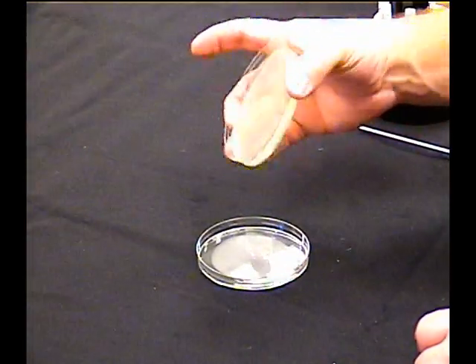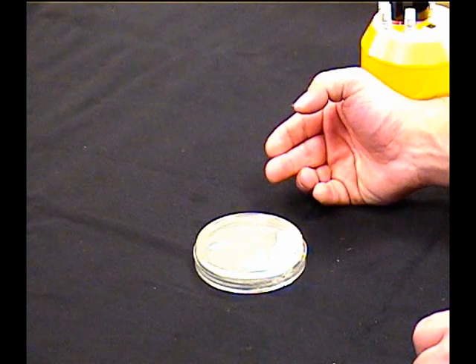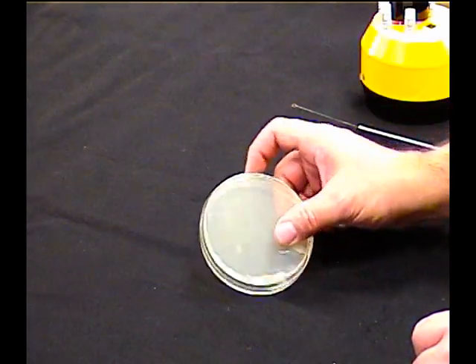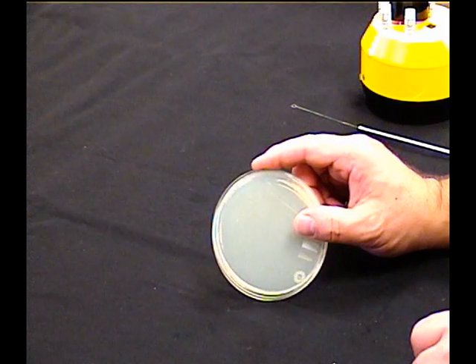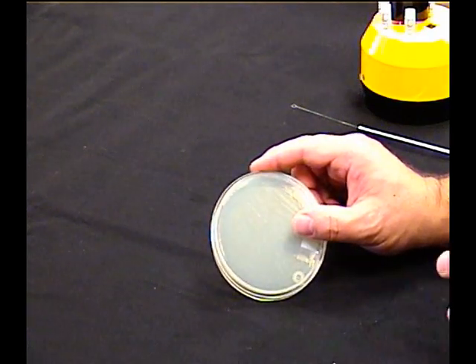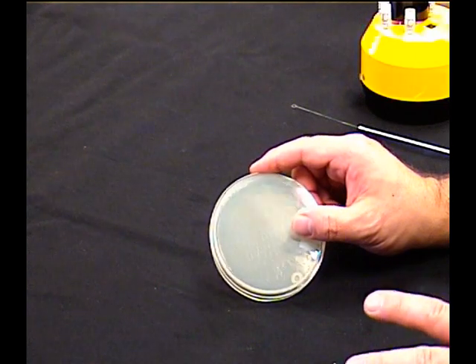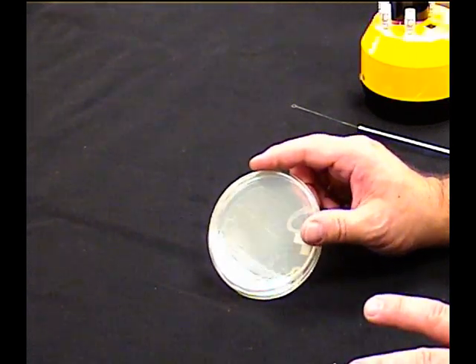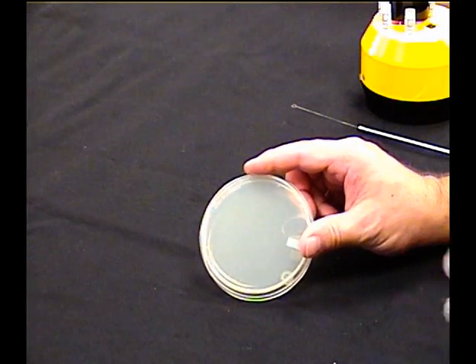Once you're done with that, put it lid down and write on the plate what the organism is and your initials. Do it now because once you get the filter paper discs on, you have to leave it right side up. If you don't leave it right side up, the discs fall off. If the discs fall off, it doesn't work so well.